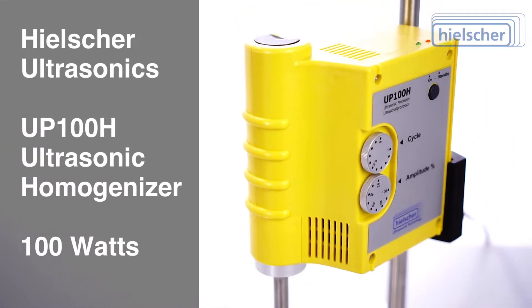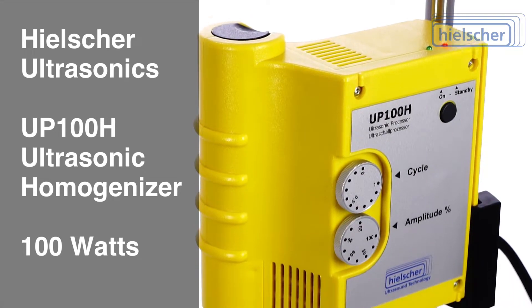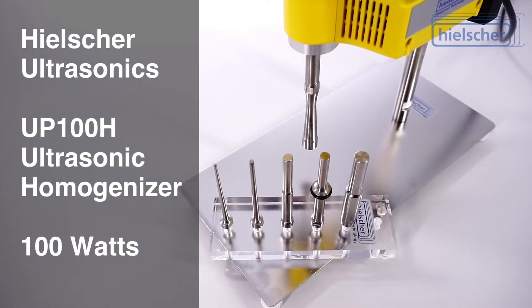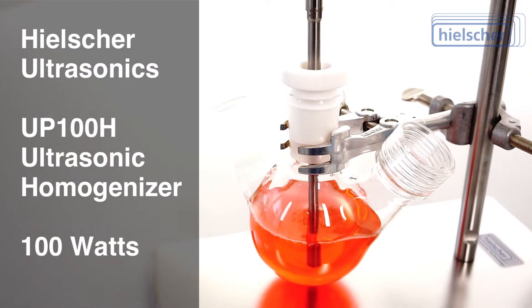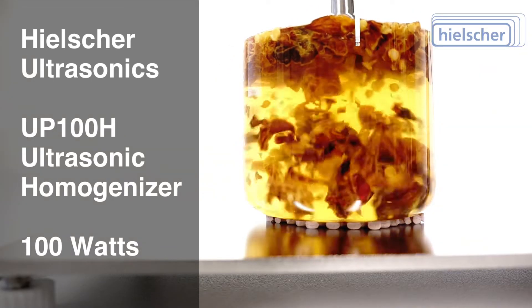The Healshure UP100H has 100 watts of ultrasonic power. You can easily adjust the intensity — that is the amplitude of the sonication — at the dial. Different sonotrode lengths and diameters from 0.5 mm to 14 mm allow the adaption to your specific application. Of course, the UP100H can also be used in continuous operation at full power.